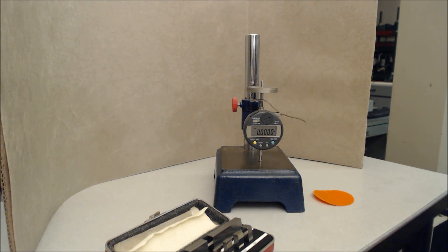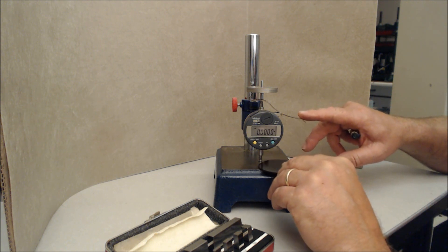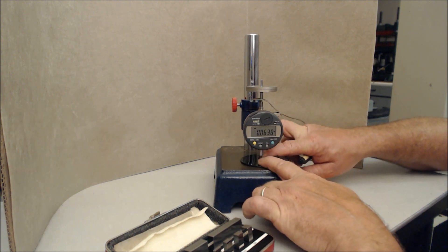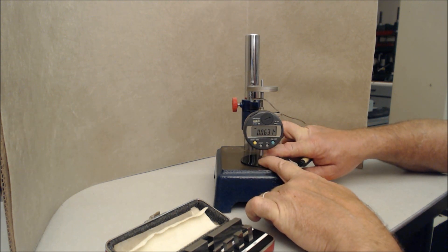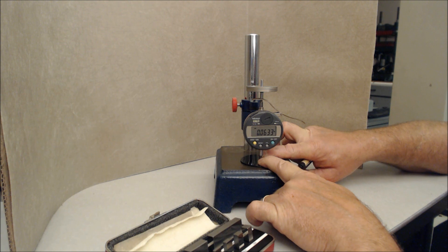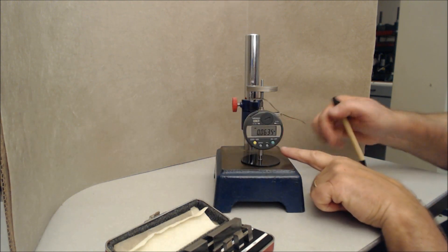This is for smooth geomembrane. The first geomembrane I'll test is this smooth geomembrane before you. It's a circular sample. You do have to press down on the sides of the material so there's no curl. Some of these materials are quite stiff, and you can't leave them in the machine in isolation. We'll press on the two opposing sides.